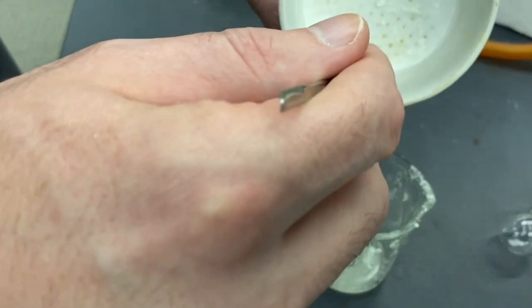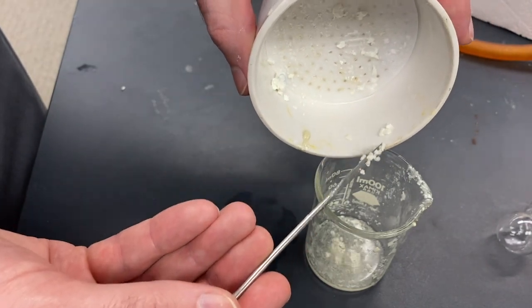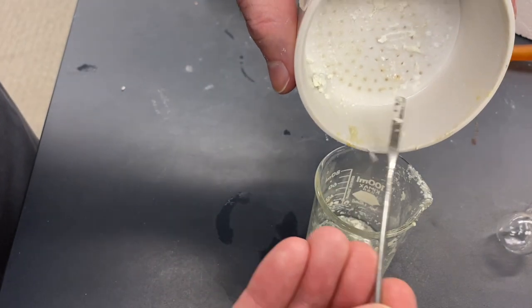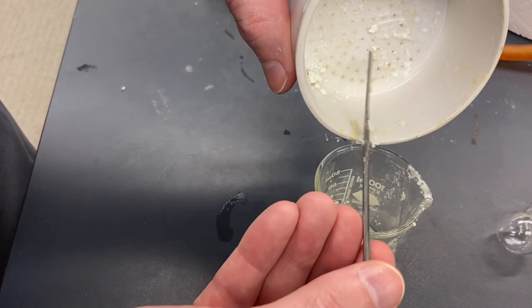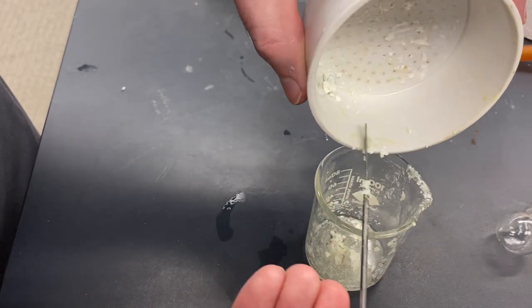What we're going to do is add just enough and get it hot. So we're going to have to put this on a heating plate or a heating well or something to get that temperature up.